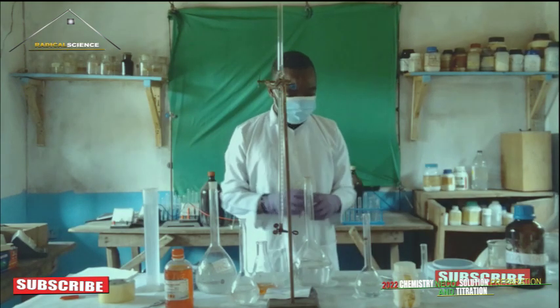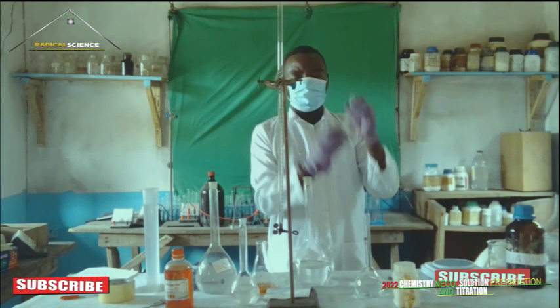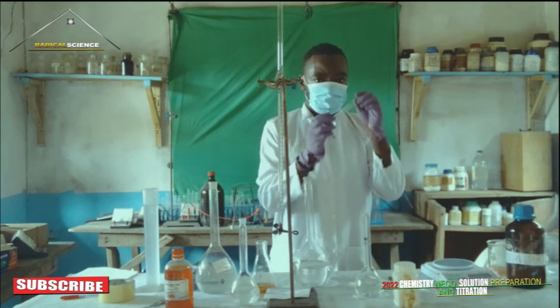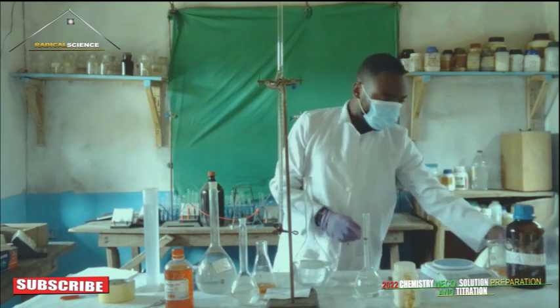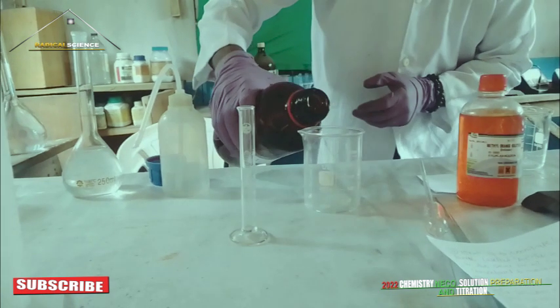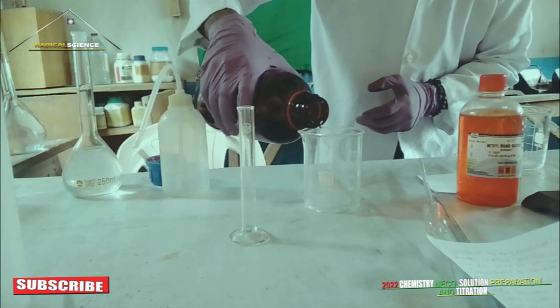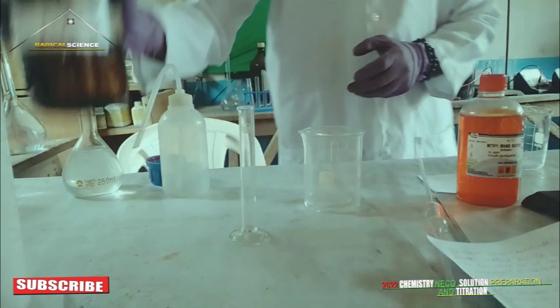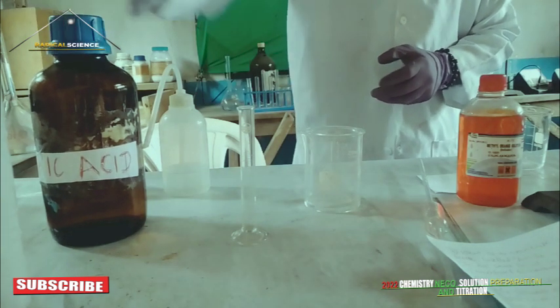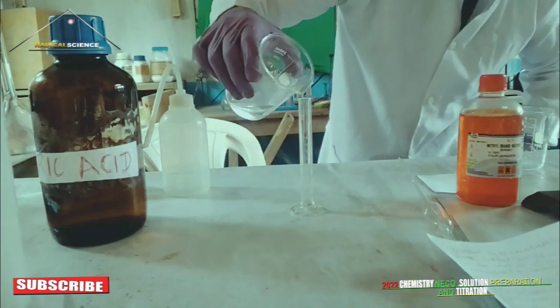Now all we need to do is measure 9.5 cm cube of this solution. First of all, you pour this into this particular container so that it will be very easy for us. We now gently pour in here.